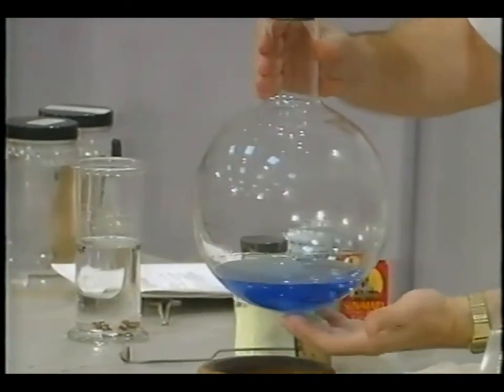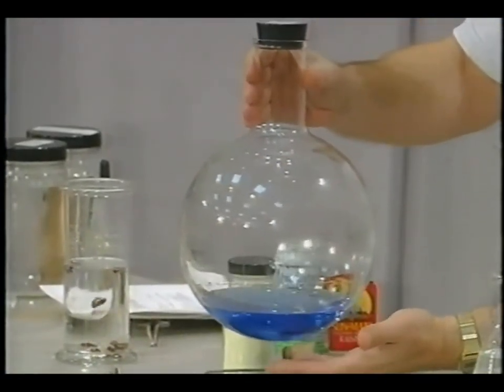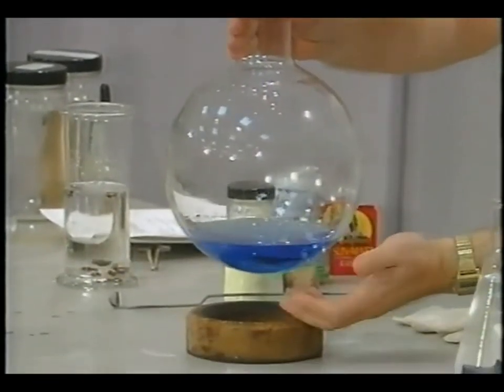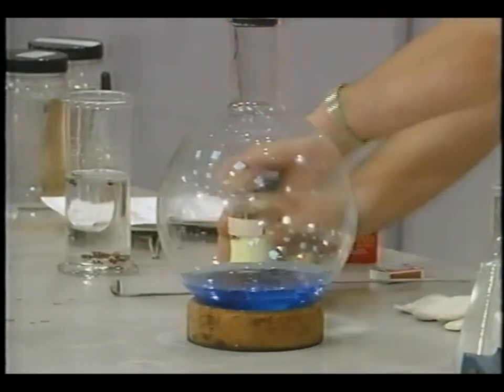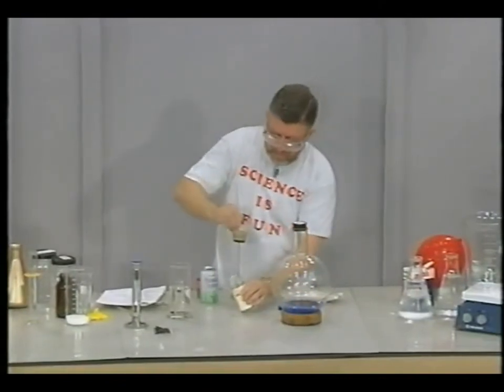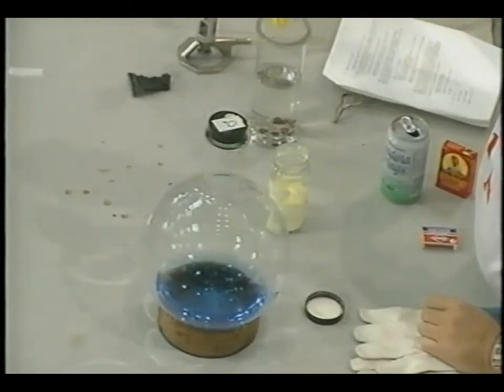At the bottom, you see that we have a blue-colored liquid. This is actually water, and we've added to it an indicator that indicates to us whether we have an acid or a base. So what we'll have is some of the sulfur. We burn it in the flame like so.